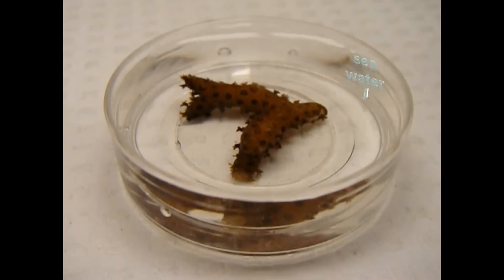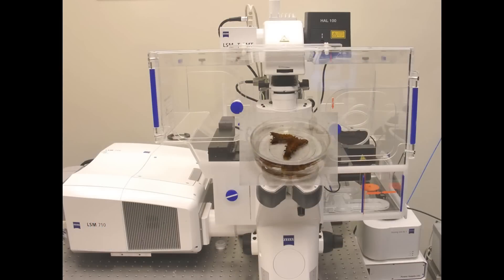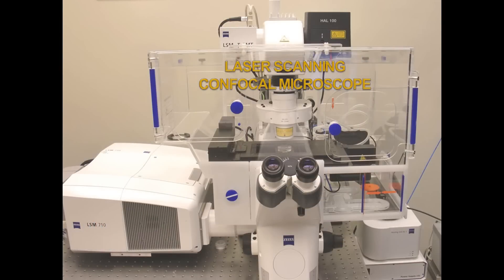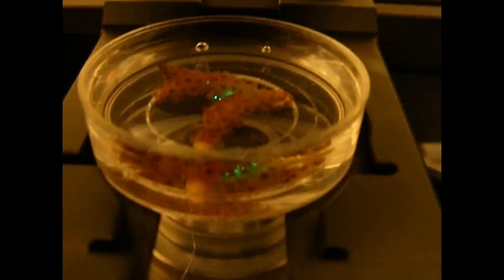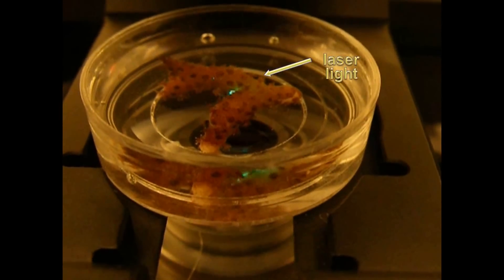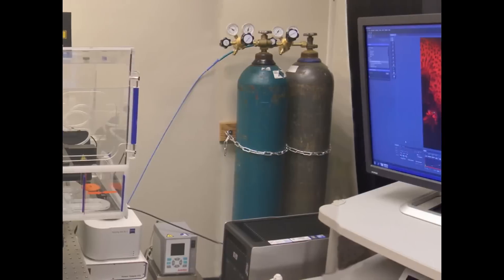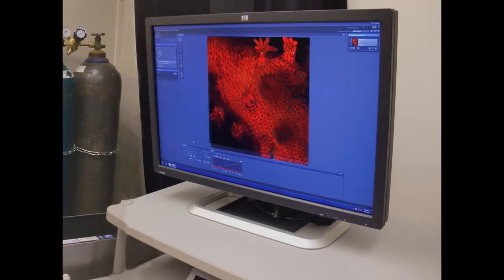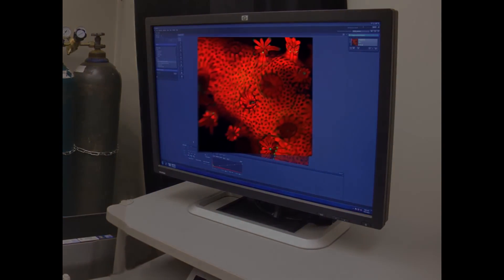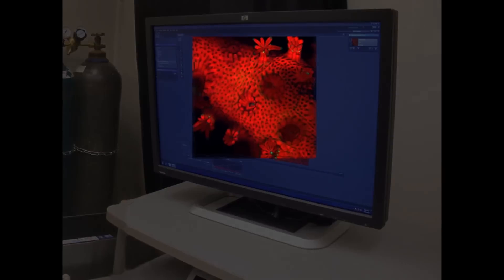In order to better understand the coral symbiome, we use confocal microscopy, which allows us to observe the living coral in a non-invasive manner. Much can be learned from these observations, including the signature and distribution of innate fluorophores, the distribution and fluorescent emission of endosymbiotic algae, and the presence and characterization of coral larvae and associated epifauna.